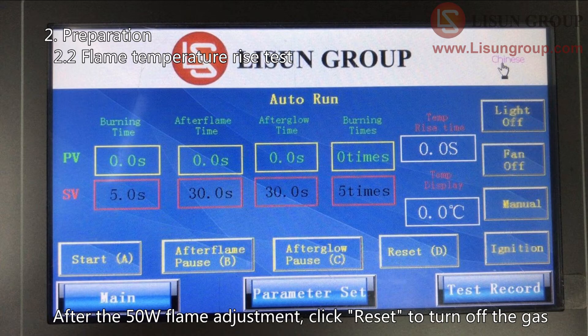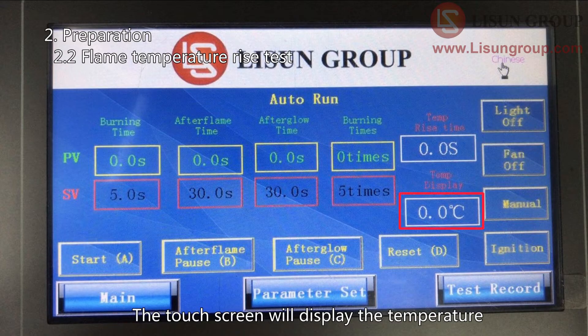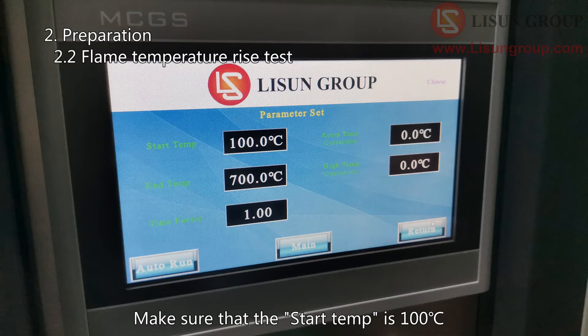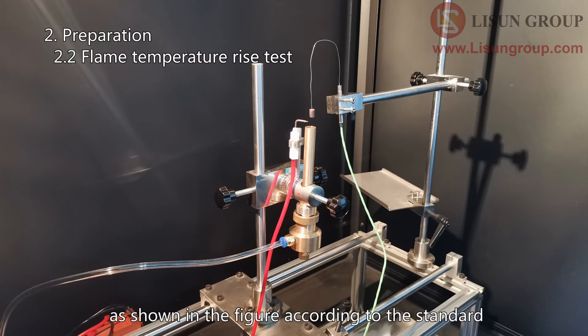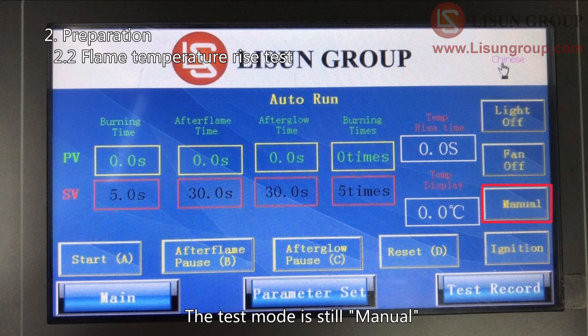After the 50 Watt flame adjustment, click Reset to turn off the gas. Plug the thermocouple into the reserved port in the chamber. The touch screen will display the temperature. Enter the parameter set interface. Make sure that the start temperature is 100 degrees Celsius and the end temperature is 700 degrees Celsius. Adjust the position of the Bunsen burner and the thermocouple as shown in the figure according to the standard. Then move the Bunsen burner to the left side. The test mode is still manual.